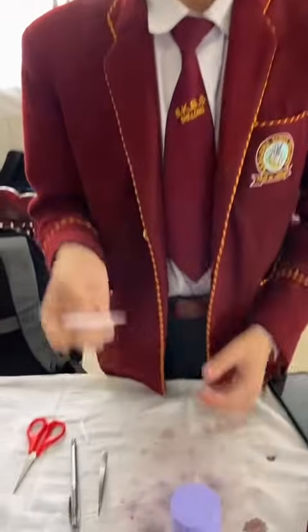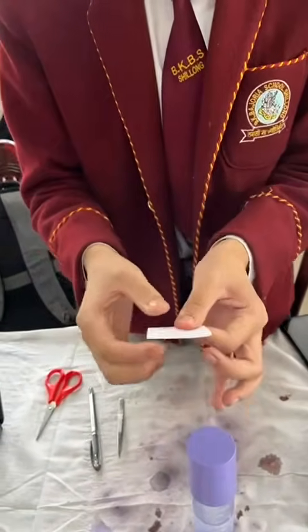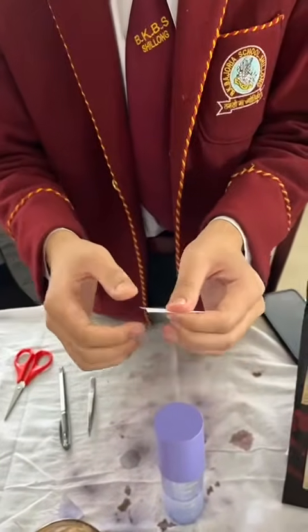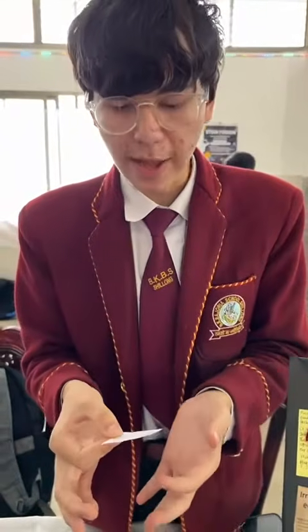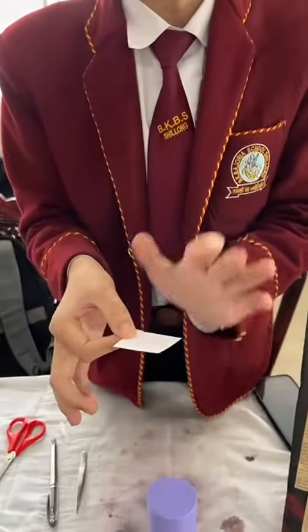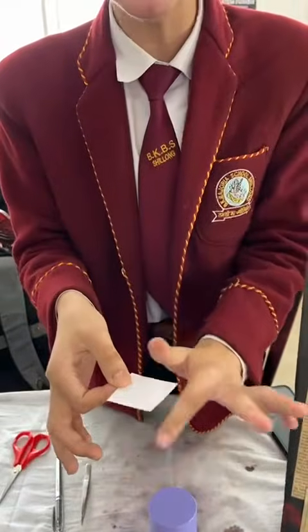For example, let's say this is an important document, and let's say a criminal comes in and barges in and touches your document. So what happens is, when a criminal does this, he gets really nervous, really scared, and in that process, there's a lot of sweat and oil secretion in his fingers. So if he touches any porous material, the oil from his hands gets transferred onto the paper, and in that process, his fingerprints also get imprinted on the paper.